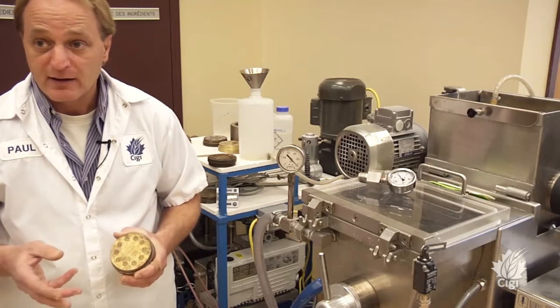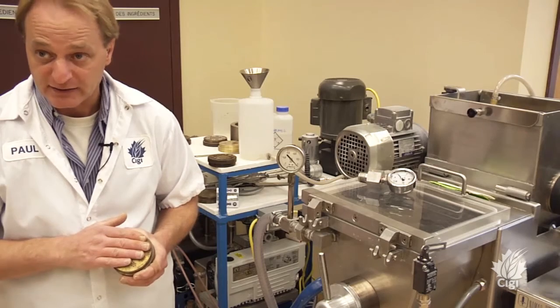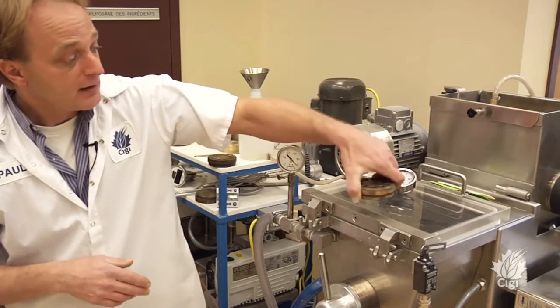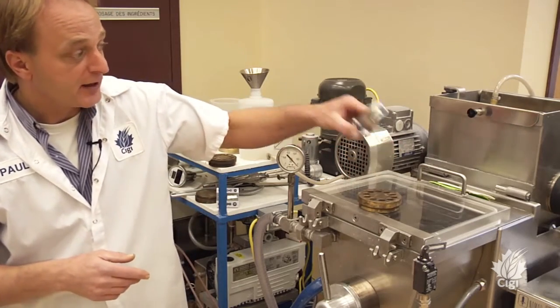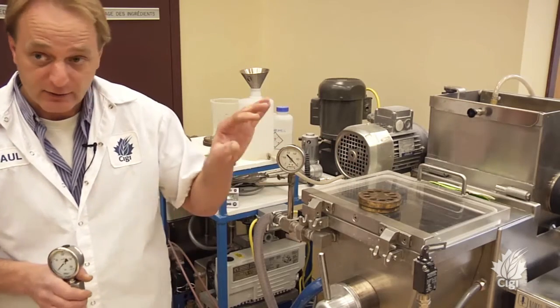If the dough is too wet, the pressure at the die will be lower; if the dough is too dry, the pressure will be very high. Typically we aim for about 1,400 psi — or about 100 bars — when the dough goes through the die. The most important characteristics for pasta are the colour and the biting quality, and we have instruments to test for both colour and the strength of the pasta.